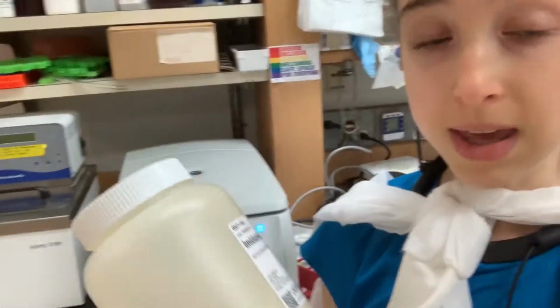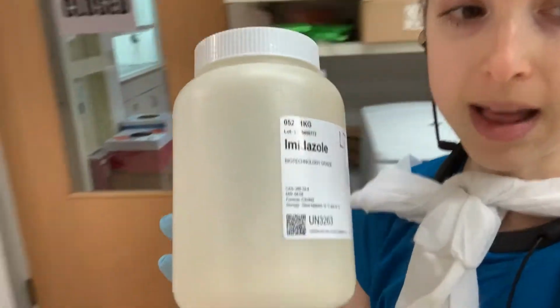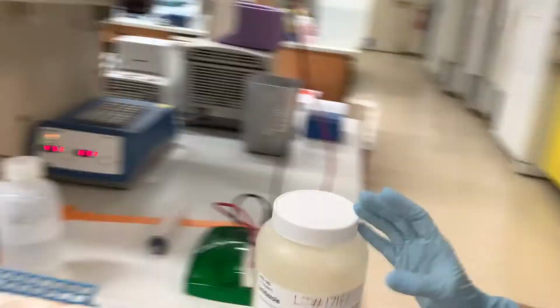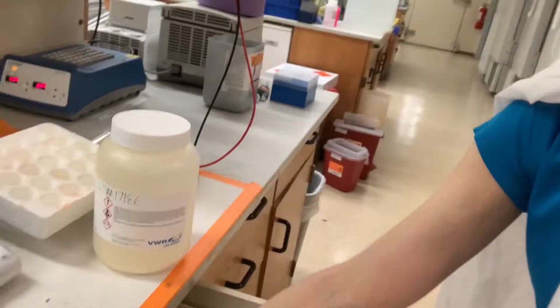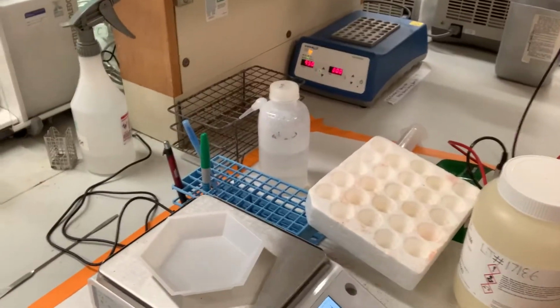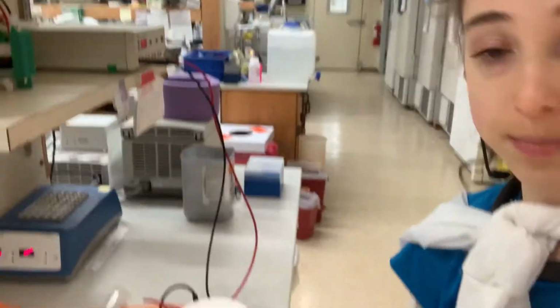When you go to make a solution, typically what I do is, I weigh it out. So you want to make sure that when you're weighing it out, you're zeroing or taring the scale. You can use different size weigh boats for what you need, but make sure you zero it, so you're not weighing the weight of the weigh boat.